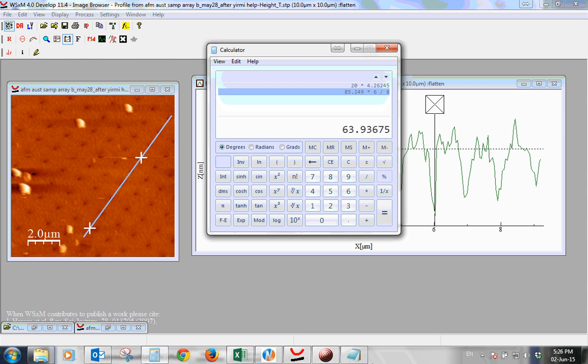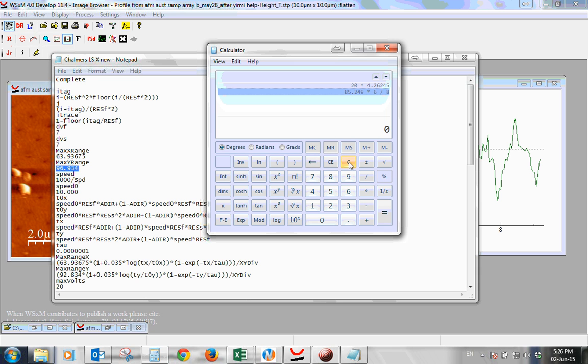We look at the range for the y, which is right here, 96.934. And we multiply that by what we're supposed to get, so that's 6. We're going to divide it by 5.3. So the value should be now 109.73660.